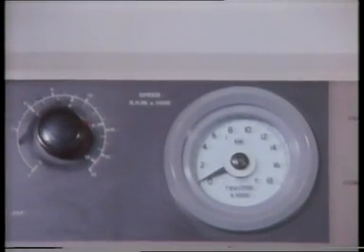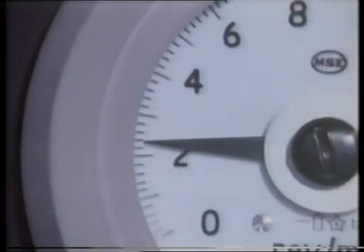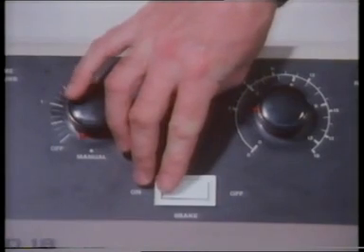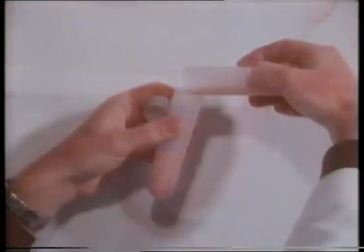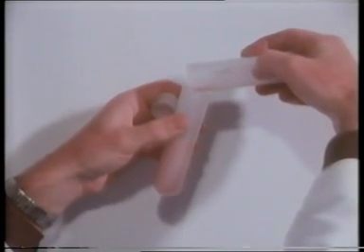The homogenate is first spun at about 2,400 revolutions per minute for ten minutes. This separates out the nuclei and cell debris, which are driven to the bottom of the tube as a solid mass. The lighter mitochondria remain suspended in the supernatant, which is carefully poured off.